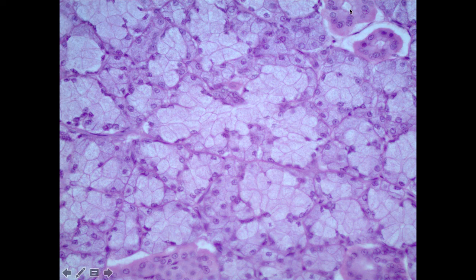And so as you look at these slides, recognize, and I think it's important to note, that there are always different cell types within the same field of view. And that's just the nature of taking samples from an organ. It's composed of all the tissue types typically. And so when you look at something like this, this is glandular ET. This is the secretory stuff. Whereas these represent the ducts of those glands that transport the contents to the surface.